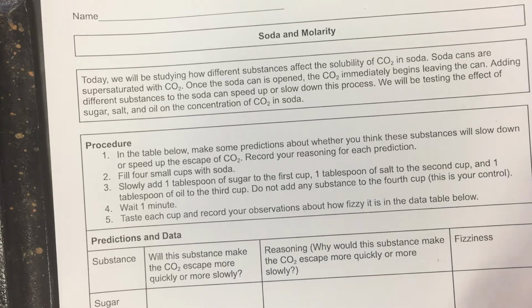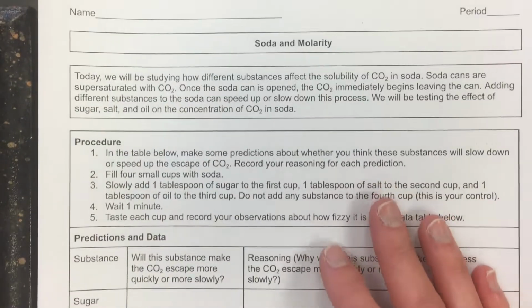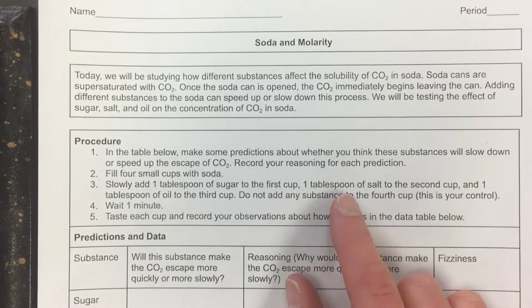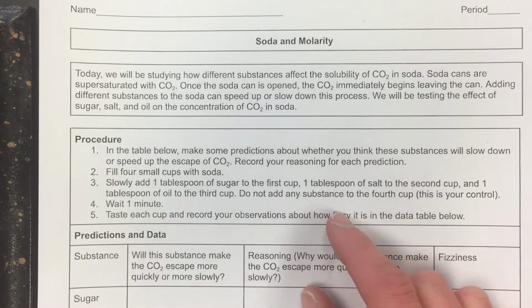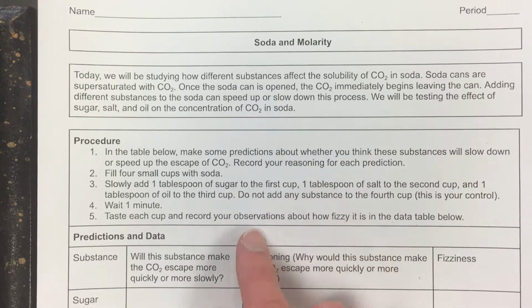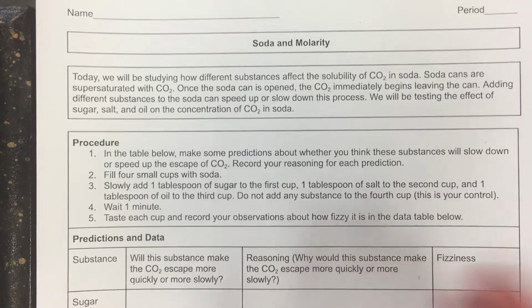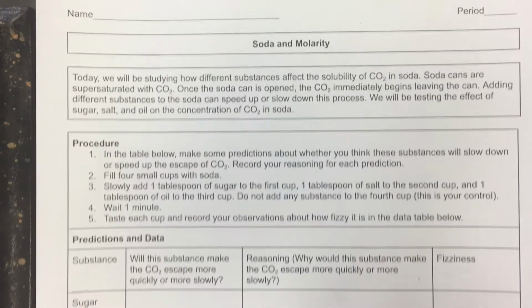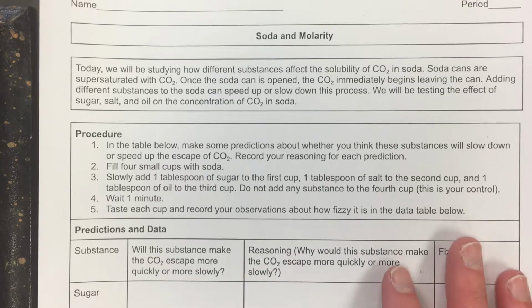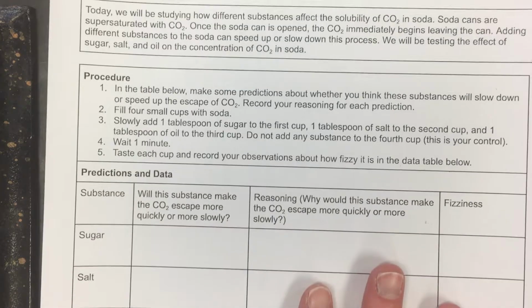Hey everyone, so in this lab we are going to be looking at the concentration of carbon dioxide in soda, specifically in Sprite. So the first thing we did if you were in class is we actually added some stuff to soda to see how that would affect how much carbon dioxide was in the soda. So obviously if there was less carbon dioxide, the soda tasted really flat. And if there was more carbon dioxide, the soda didn't taste flat. It still tasted fizzy.